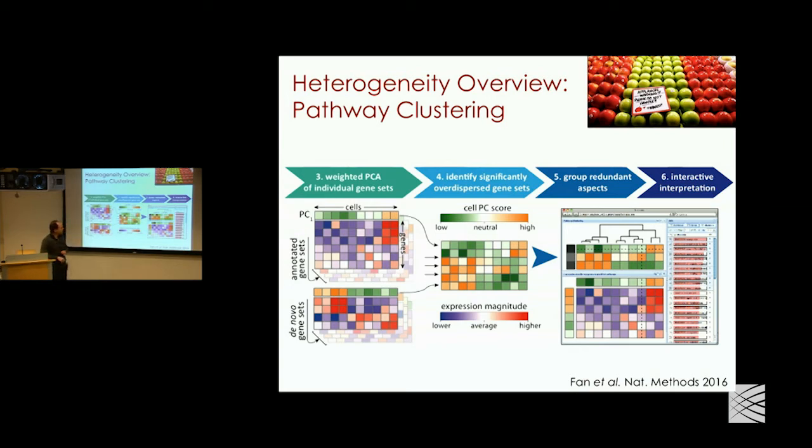Yeah, it's actually quite clear, I think. In very noisy data, if you're limited by statistical power, then the annotated gene sets will win, just because the prior they bring will significantly improve the p-value. Now under it, let's say if you just rank them, like here they're ranked by the z-score, or the p-value essentially, somewhere under it you'll see a gene cluster that captures that same pattern, but you won't have as much statistical power because you picked it up and it could have happened by chance essentially.